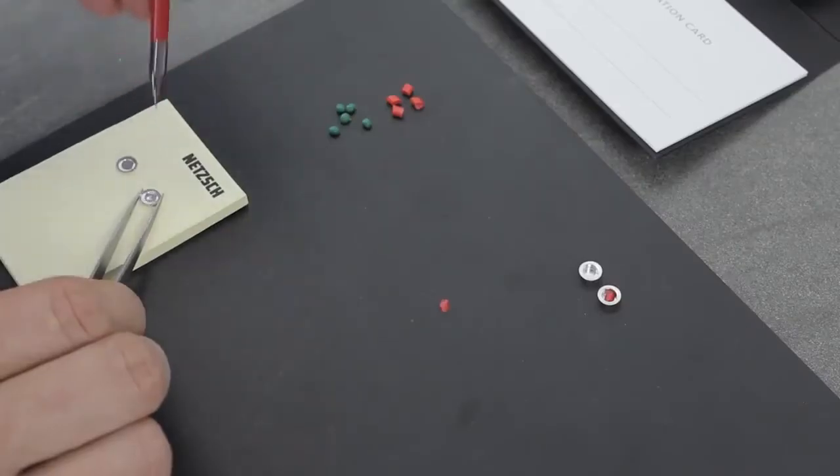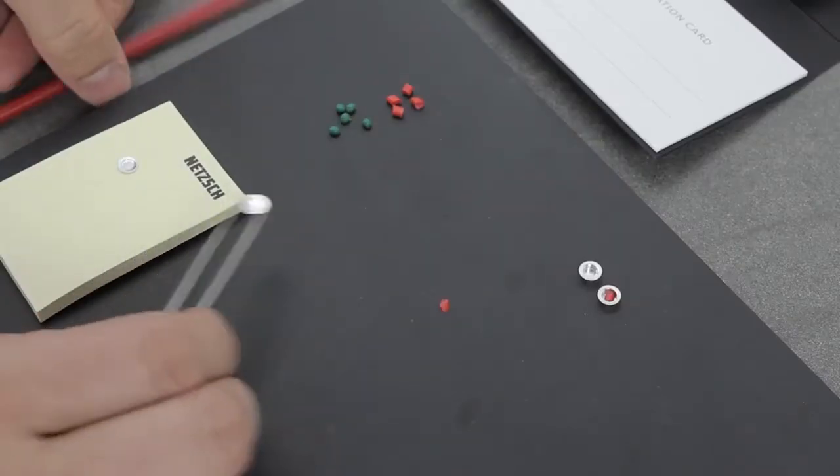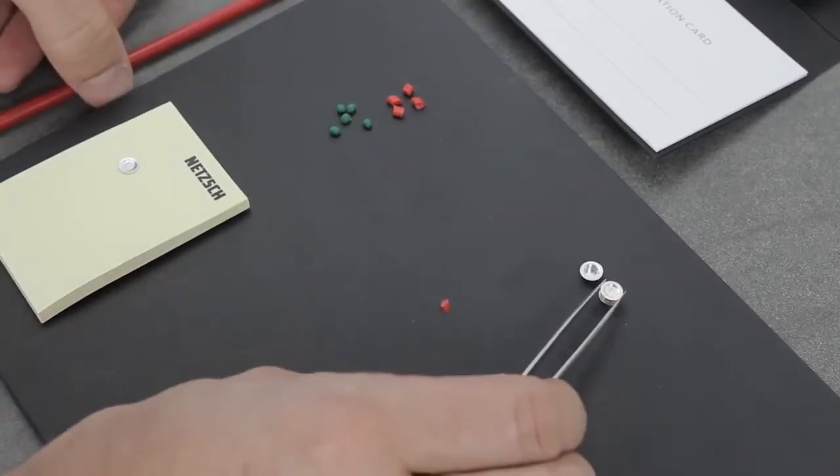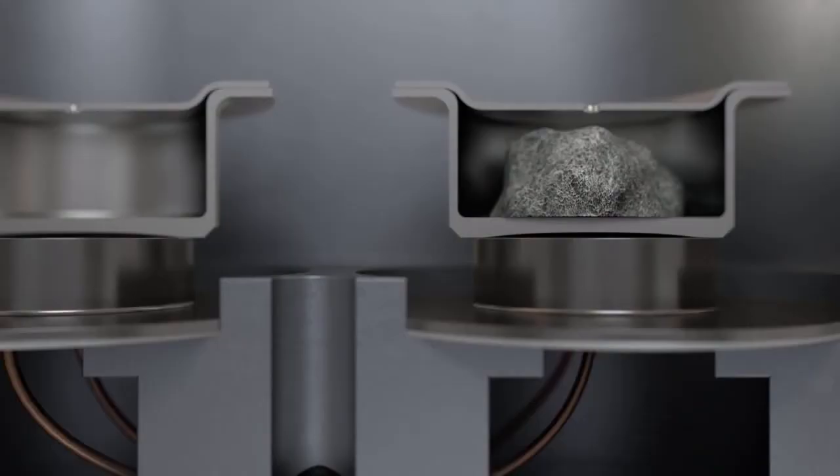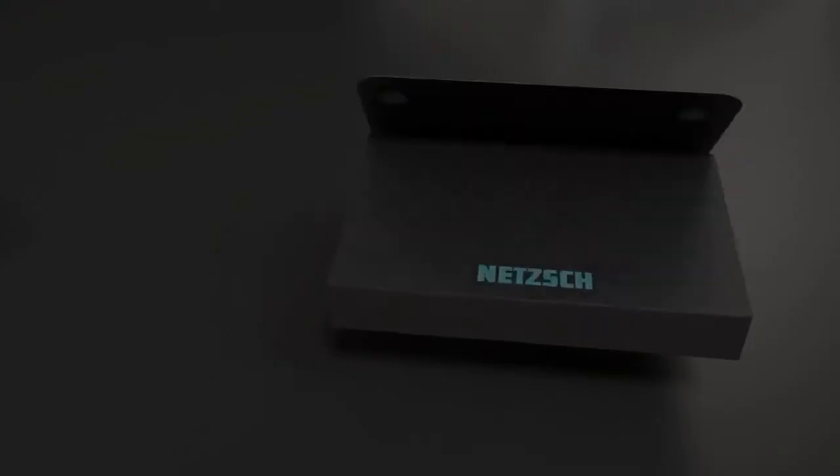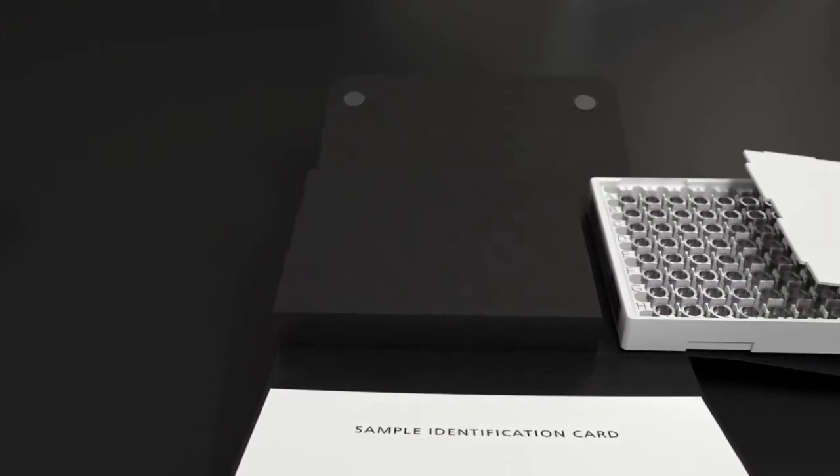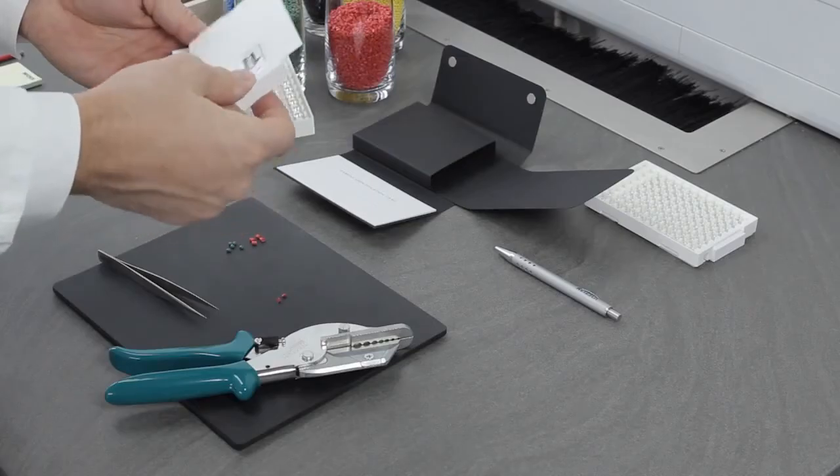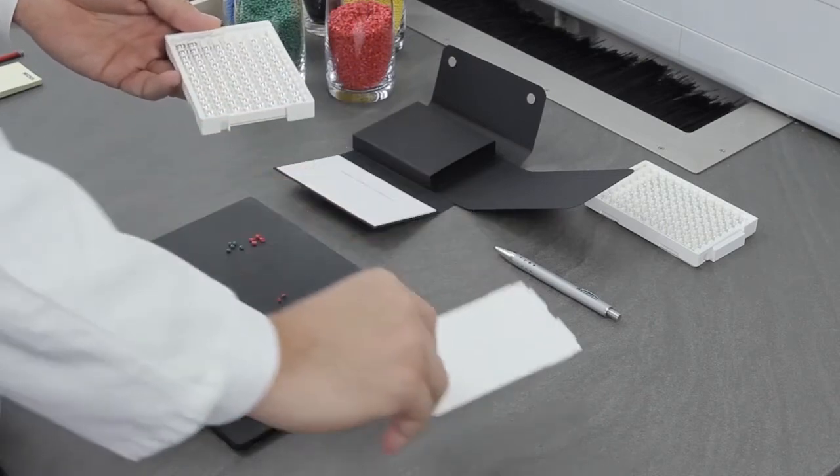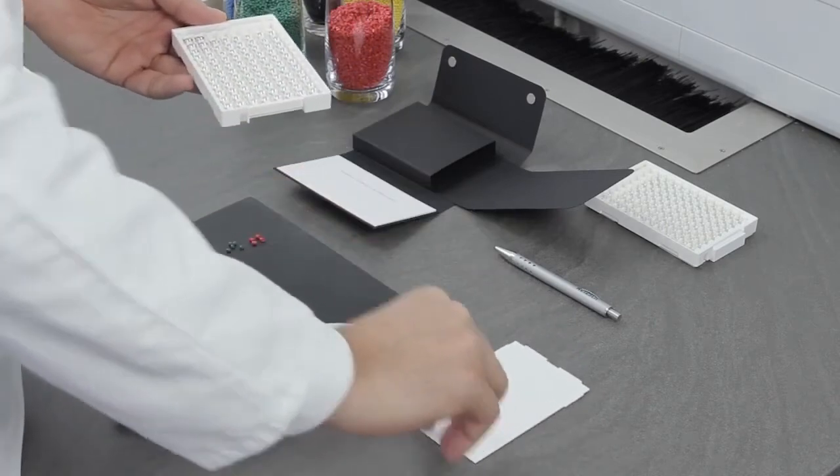Imagine innovative shaped pans developed to increase the reproducibility of your measurements. Imagine a special designed container for safe transportation of the high-quality pans, as well as for storage and archiving of your measured samples.